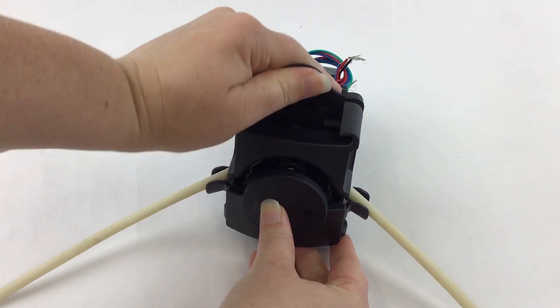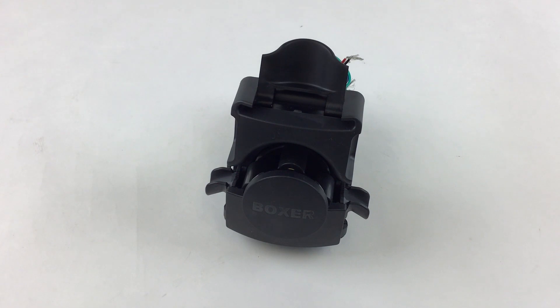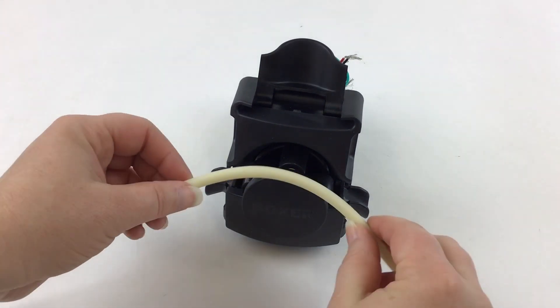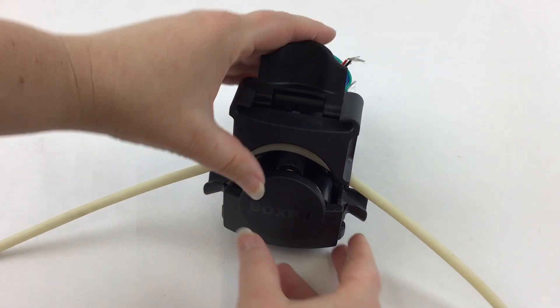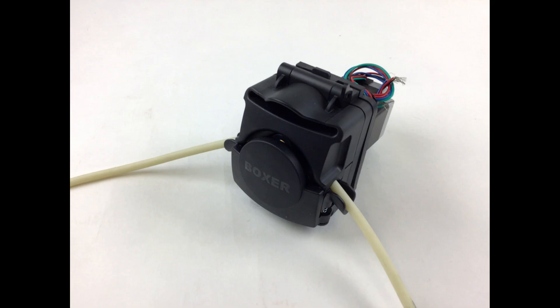Push the top lever up to open the face of the pump. You can easily remove the old tube length and slide the new tube over the rollers and into the guides on the side. Pull the top lever down to close the face of the pump and compress the tubing.